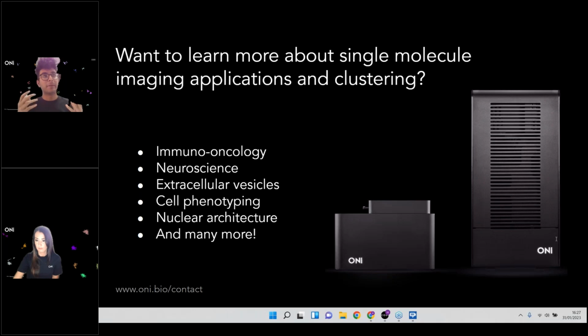But essentially, they are taking a metric which you can think of as scaling with just spatial distance, but they're doing something a bit more complicated by using something called mutual reachability. I'm not going to go into the details of that, but I'd be happy to explain it offline. You can think of a bigger distance at one end of the EPS scale and a smaller distance at the other, but the specific number of that value is not immediately interpretable. And that's one of the issues with DB scan. It's one of the things that different methods try to trade off on.